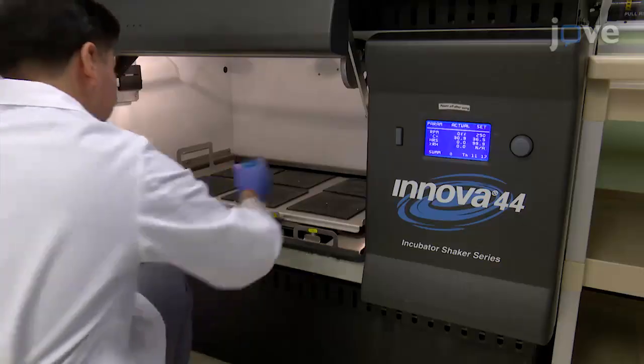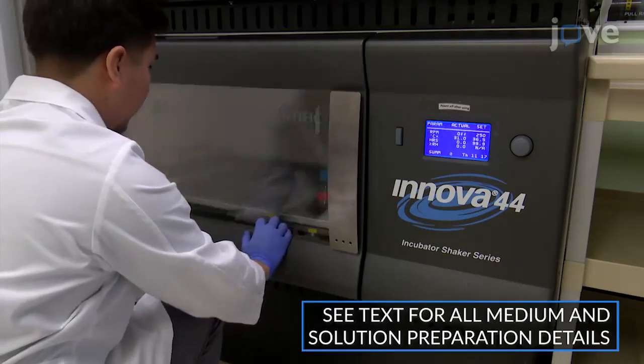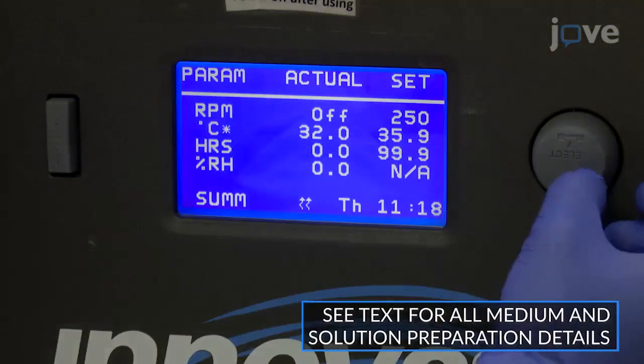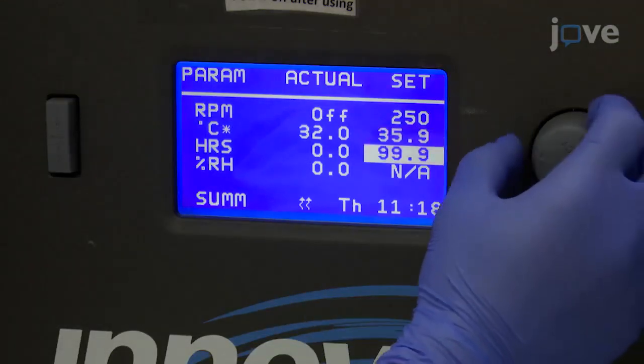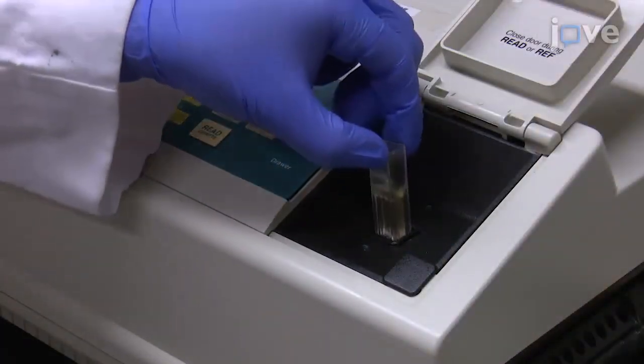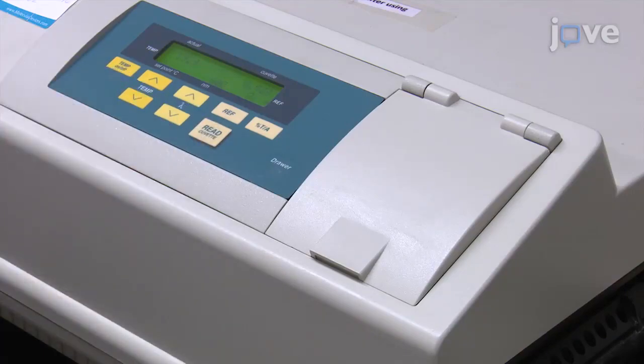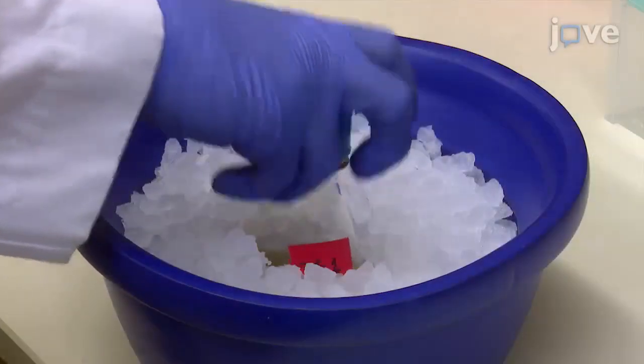Begin every round of selection by growing a single TG1 electroporation-competent cell colony in 6 milliliters of 2YT medium at 37 degrees Celsius and 250 revolutions per minute to a 600 nanometer absorbance of approximately 0.5. When the optimal optical density has been reached, place the cells on ice.